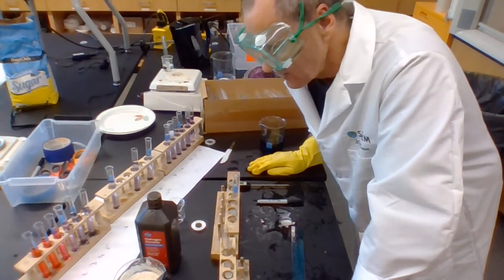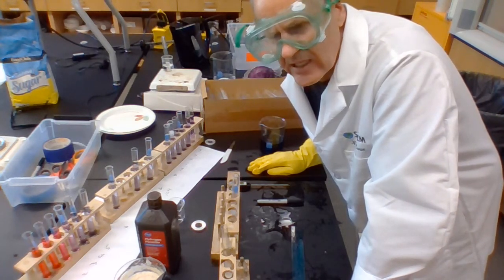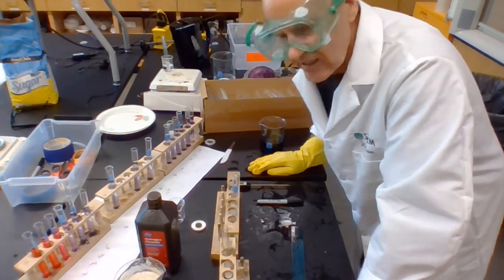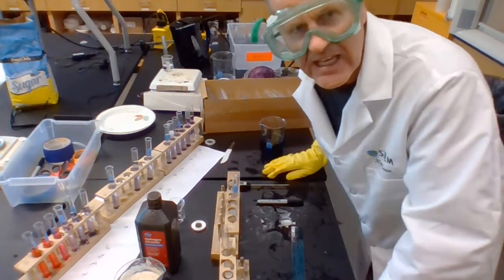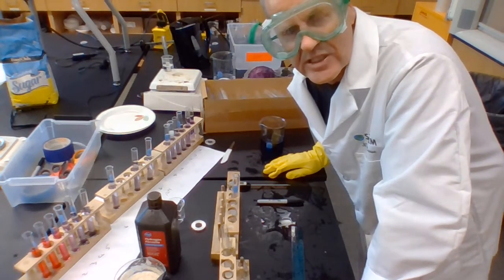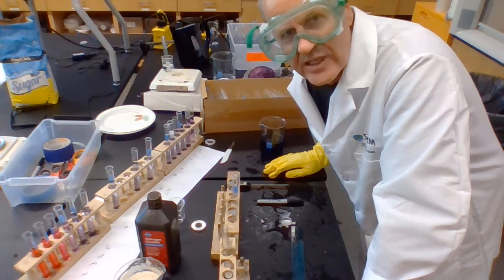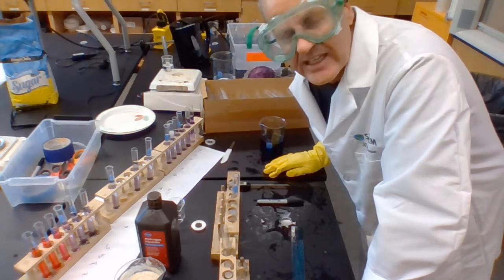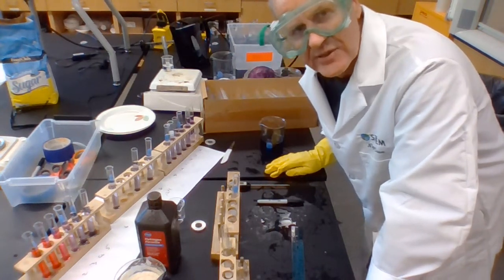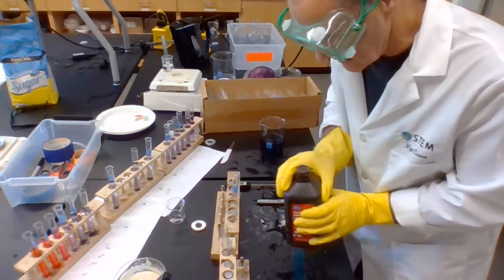When I first did this experiment, I was in Turkey and they sell it as something like 33% hydrogen peroxide. So I was there happily doing it without gloves, and after a little while, my hands started to tingle. I noticed they were turning white. So I washed my hands and the tingling went away, but then it quickly came back, and my skin went white and flaked, and it was fairly awful. Hence the gloves, even though I've only got 3% here.